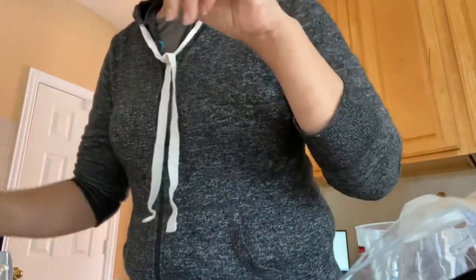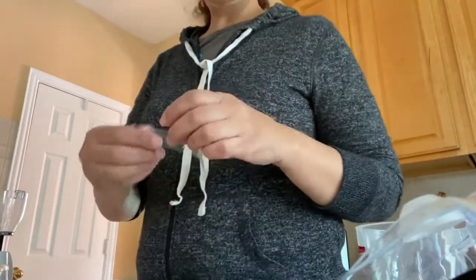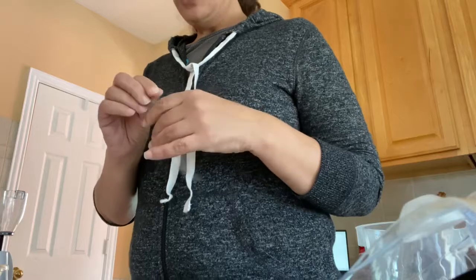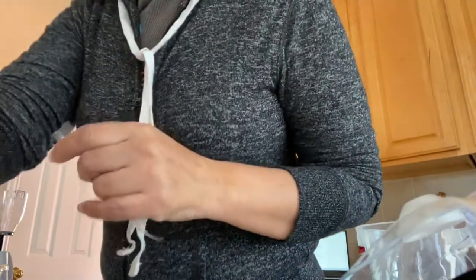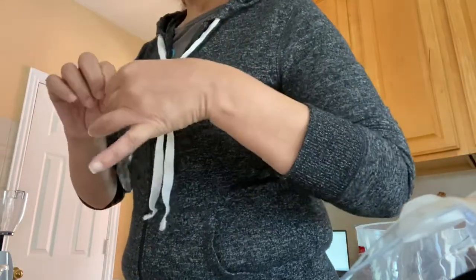I don't need gloves, but I really suggest that you use gloves in case you are allergic. Now we are just using sugar and water. So in bag A, we are going to put 10 milliliters of 1% solution of sugar. In bag B, 10% of sugar. Bag C, 50% of sugar. And bag D, 1% of sugar. We are going to make 2 bags of 1% sugar. All right. So I will start the same way that I prepared my starch solution. I will meet with you once I have all my bags ready.